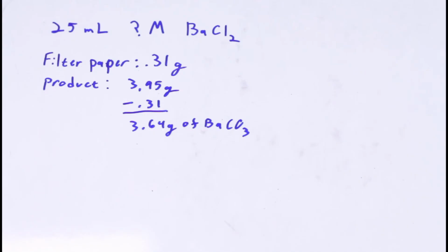Subtract the weight of the filter paper and calculate the number of moles of product created using the coefficients of the reaction.